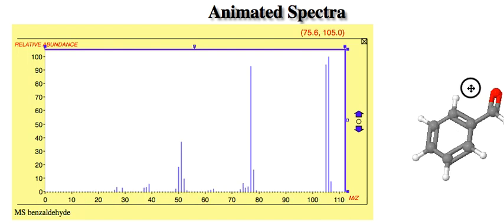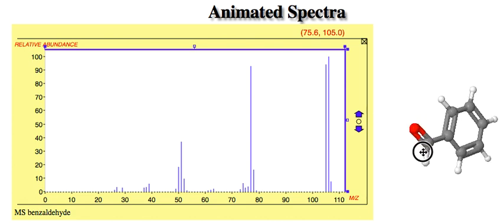And here we have one more molecule here. There was one piece I wanted to show you about this one. Here we have our parent, this is the parent peak at 106. This is the isotope peak. So 106 is going to be the 7 carbons, which is going to give us 84. And then we have 6 hydrogens, which is going to give us, we're now at 90, and the 16 from the oxygen. So 106 gives us this peak here. And this is the isotope peak.